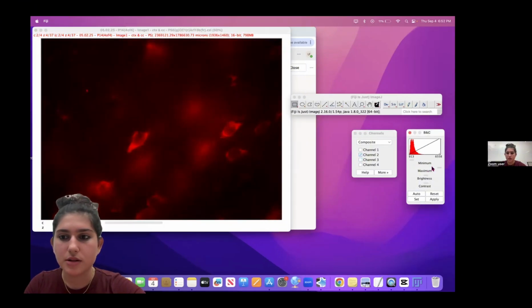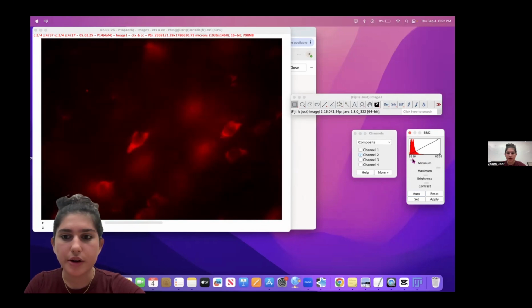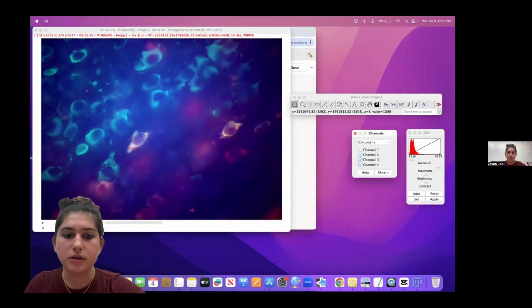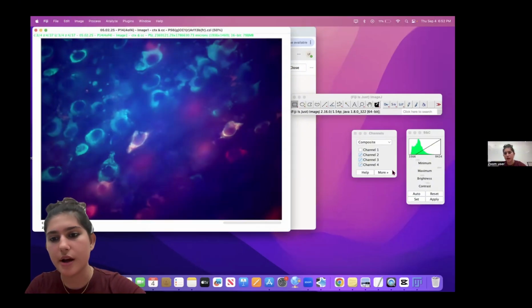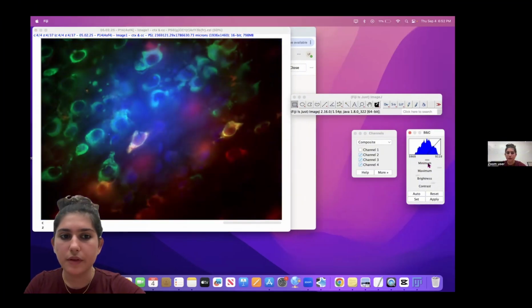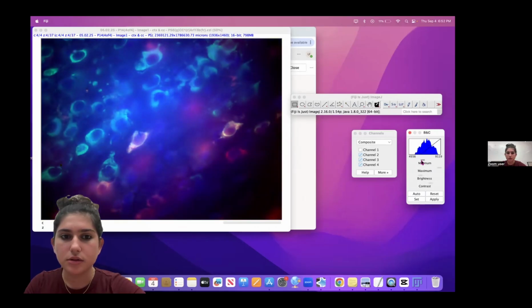Let's fix that as well to make it brighter or darker. And now these are the two overlapping. Let's go with that piece, see how we can change that. And that's kind of the gist of it. Okay, here it is. Mess around with it, make it brighter, darker.